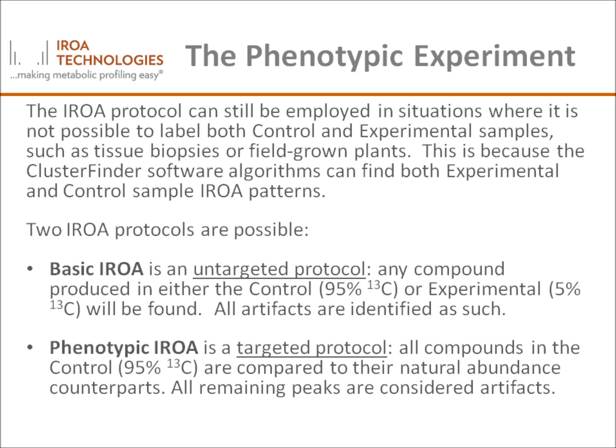There are many cases where it's not practical or possible to label the experimental sample. For example, when working with tissue samples, or performing large fermentation runs, or propagating field-grown plants. In these instances, the IROA phenotypic experiment may be applied.